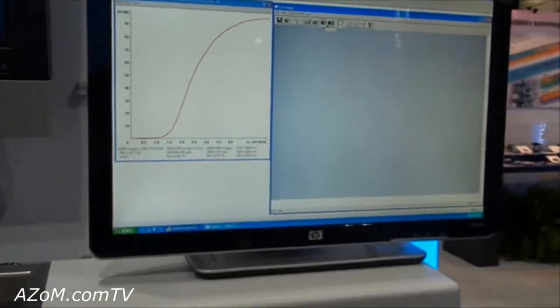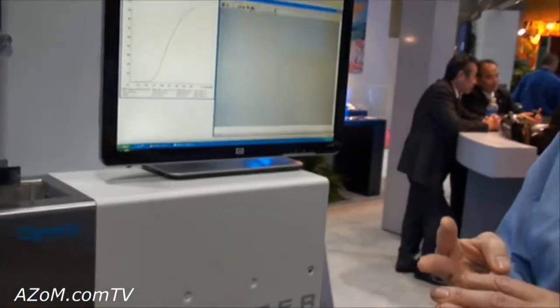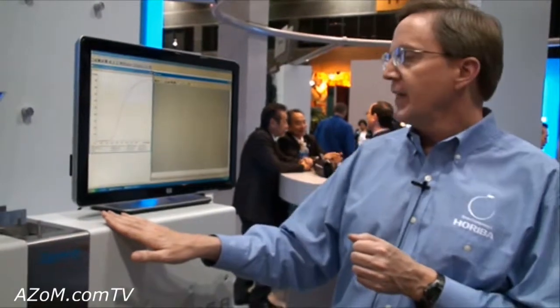Has also been used very successfully to replace sieve analysis with more automated results and also much more information about the sample. This is used largely for powder materials and used for fertilizer industry, used in the pharmaceutical industry, catalysts, glass beads, foods, all kinds of places where we're talking about powders that are up over 30 microns in size.